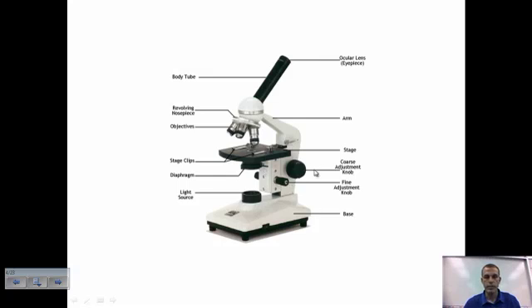You have your coarse adjustment and your fine adjustment. Coarse adjustment brings things into rapid focus. Fine adjustment you're going to use when you get to low and high power to make that final adjustment you need to see things clearly. The coarse adjustment knob is only used on scanning power, the lowest power you have, because if you use it with high power you're more likely to crack the slide. We have our base, our light source, our diaphragm, objective lenses, and the revolving nose piece that your objective lenses are attached to.